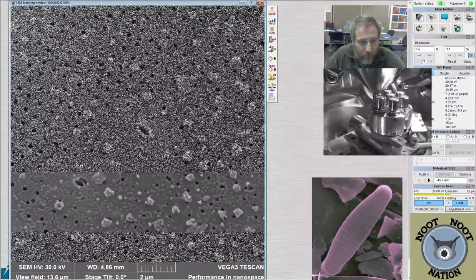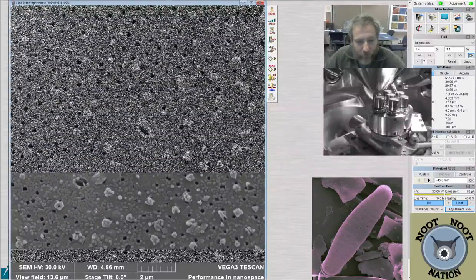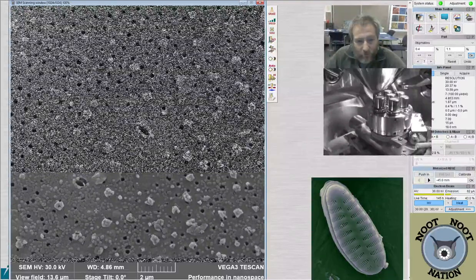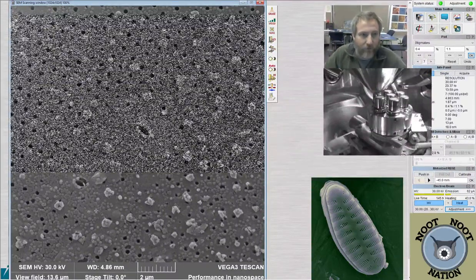And then the rimaportula is sort of a specialized process for diatoms that is different than the rest of these. Their purpose is not completely clear, but usually thought to be related to allowing diatoms to divide more easily, to center their nucleus and things like that.